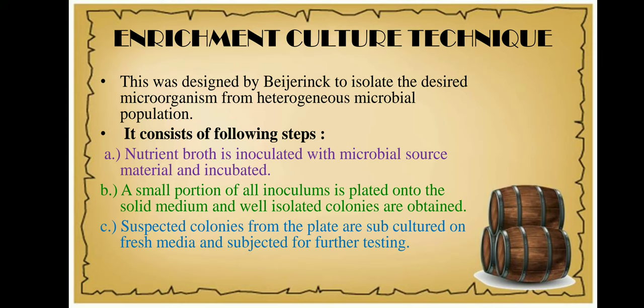I will take the well-isolated colonies on the petri plate obtained by spread plating. These colonies are suspected to produce the enzyme cellulase and will be subjected to further testing.